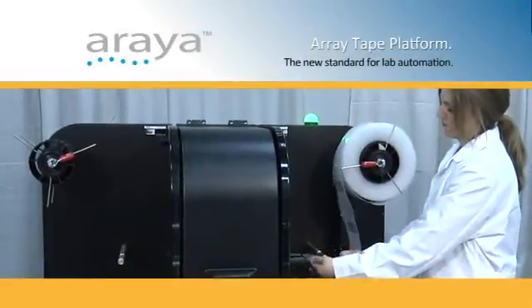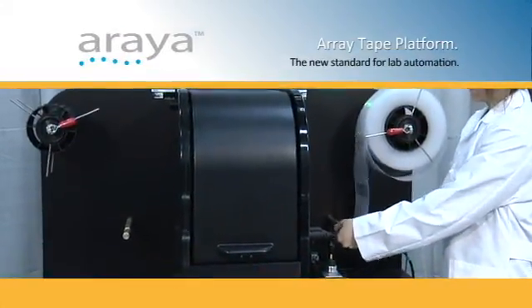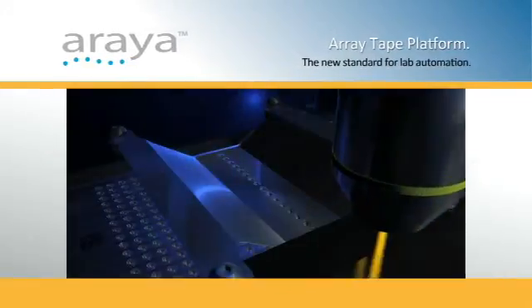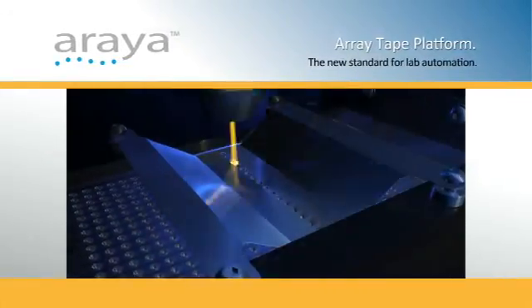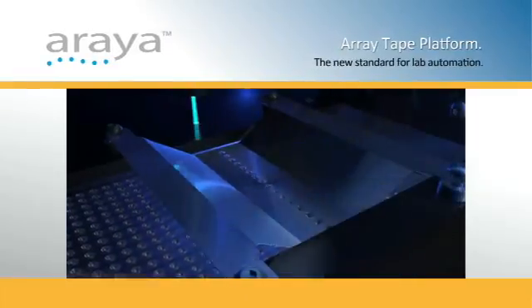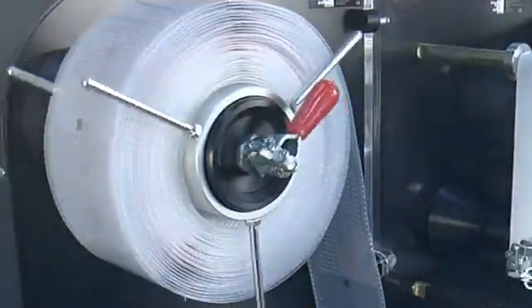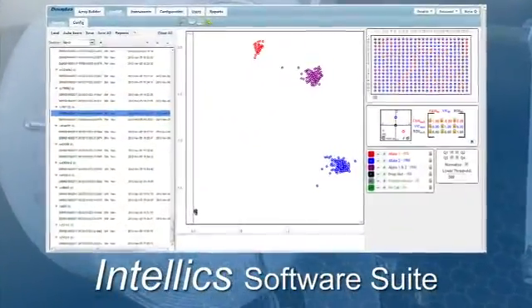The samples are then ready for the third step: detection. The Arraya, a fluorescent detection system, can scan an entire 384-well array in an astonishing 28 seconds. Your data is then ready for analysis in our industry-leading IntelliX software suite.